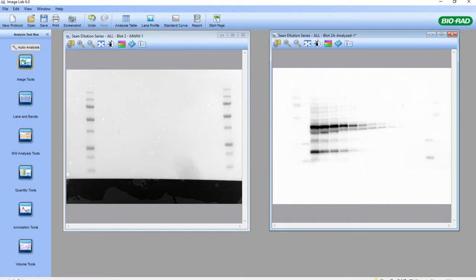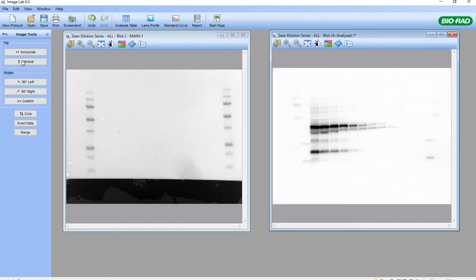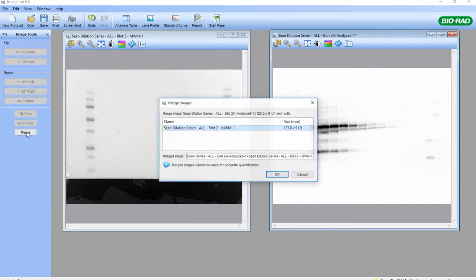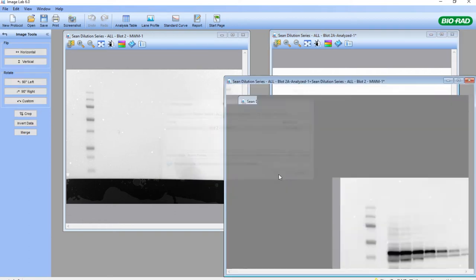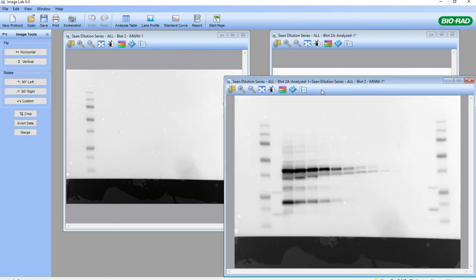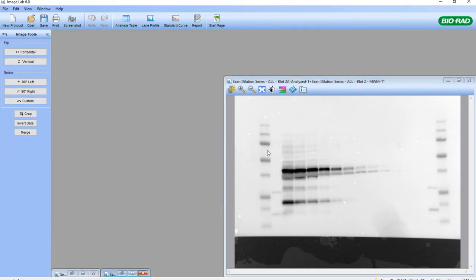Click on Image Tools and then the Merge button once these two images have been produced, and click OK. Now we've merged the two images so that we have the marker on the same image as the chemiluminescent produced bands.